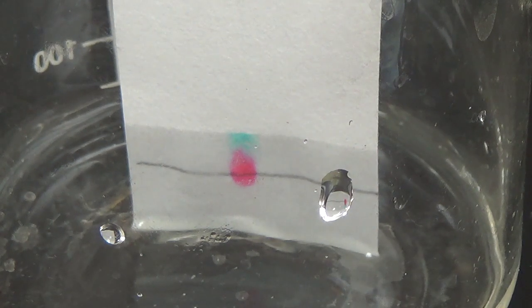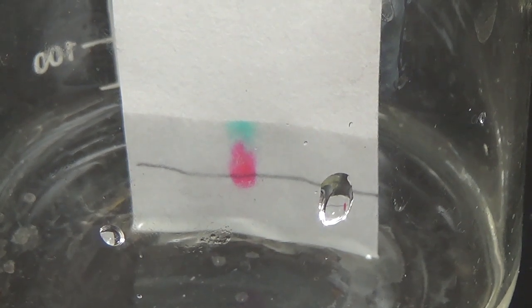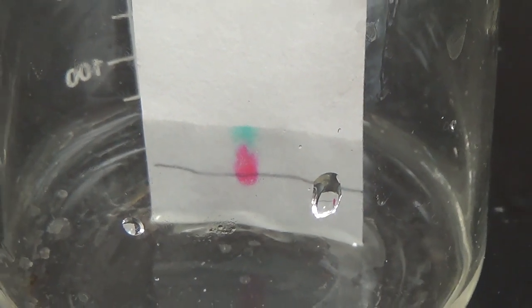We're like, oh, in the purple was some pink stuff and some blue stuff. And of course that's not shocking, because you're like, yeah, that's what mixes to make purple, but that is definitely what we are seeing. So we're going to watch this develop and you may want to sit back and enjoy a cold Mountain Dew or something like that while you wait for it.